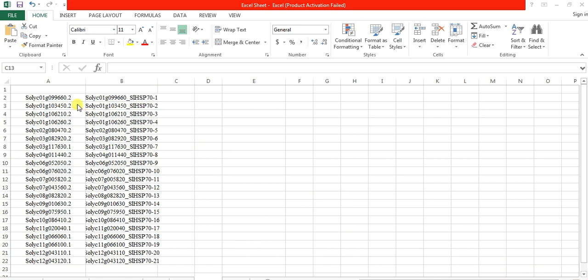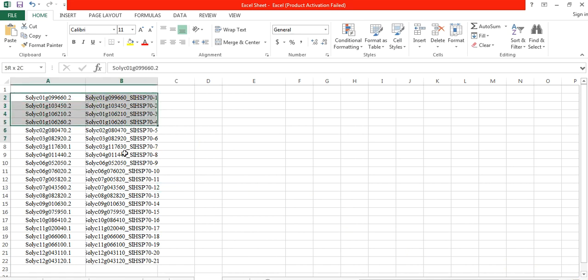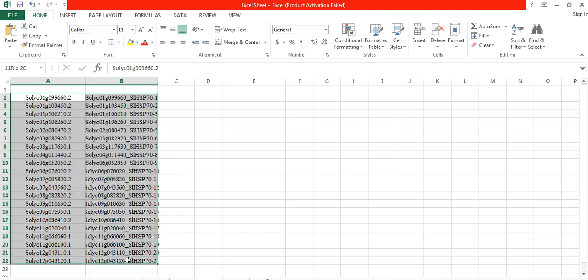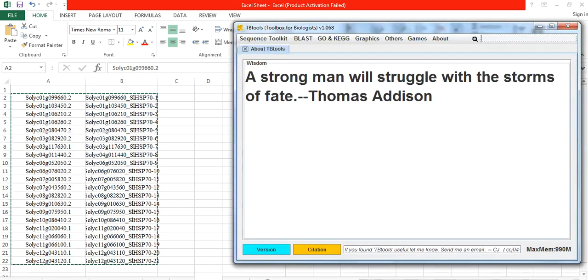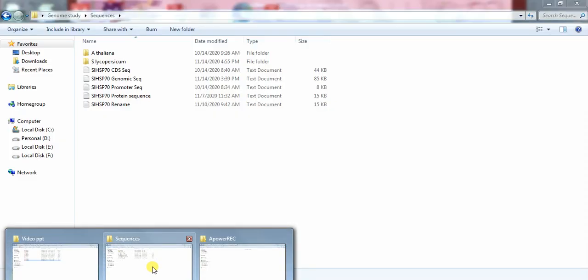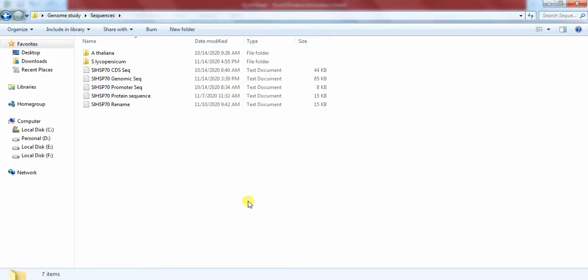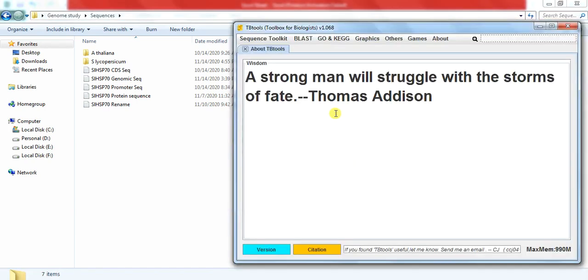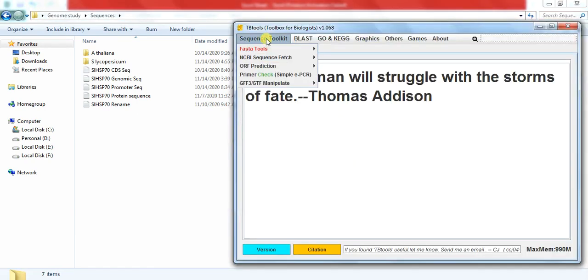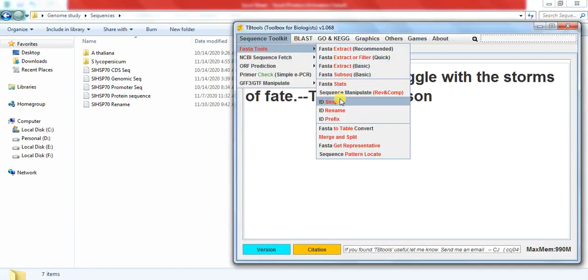After changing this transcript name into transcript as well as gene name, copy both columns. Then open the TB Tool and also go to the sequence file folder. In TB Tool, go to Sequence Toolkit, ID Rename.